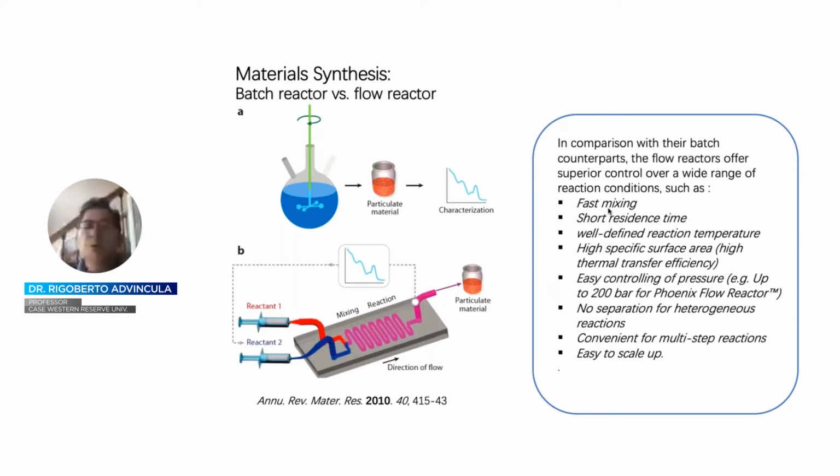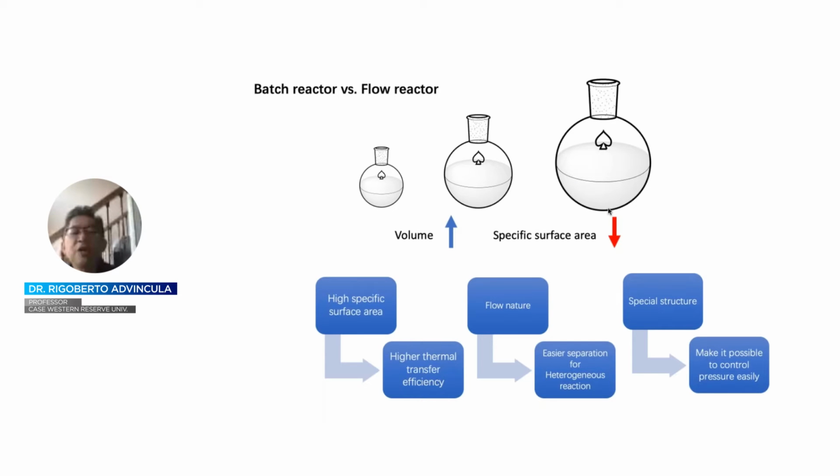So as shown here, this enables you, for example, under this flow condition, to control these environments, including thermal transfer, the application of flow conditions in a column that is embedded with catalyst, as well as introduction of a gaseous monomer. So in more of this differentiation, you can see that the surface area, the flow nature, and the control of that heterogeneity can be done under flow conditions, very different from a simple batch reaction or mixing.